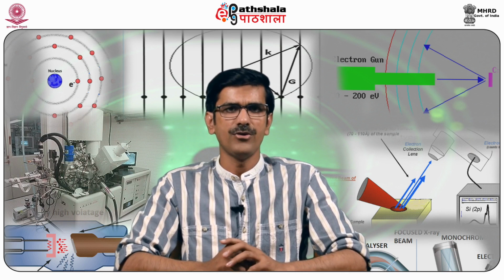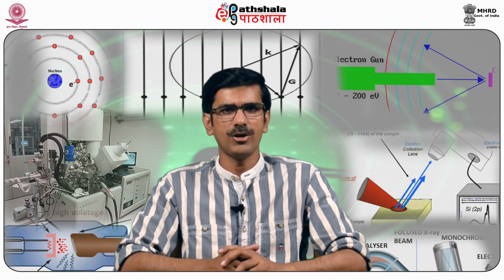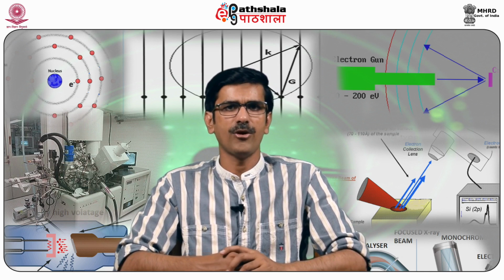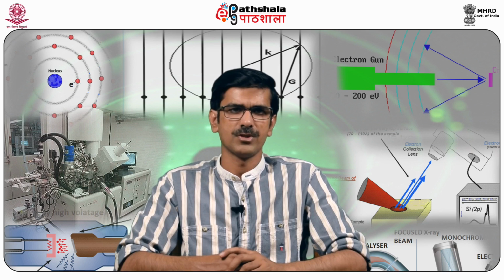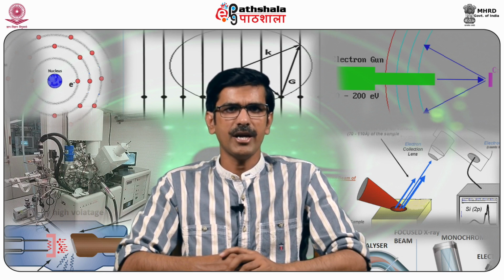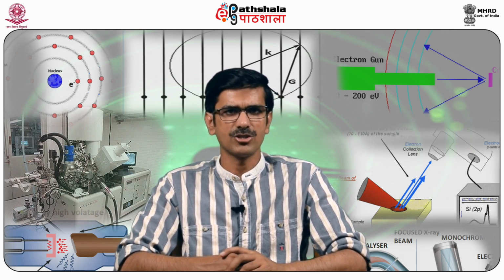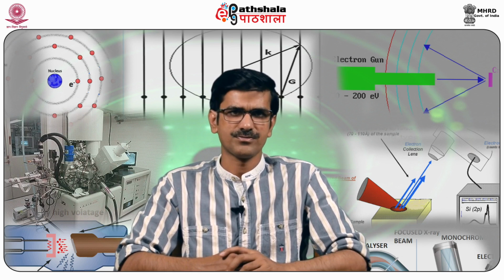Specific examples of UPS studies include: number 1, the measurement of molecular orbital energies that can be compared to theoretical values calculated from quantum chemistry. Number 2, determination and assignment of bonding, non-bonding and or anti-bonding molecular orbitals. Number 3, the binding and orientation of adsorbed species on the surface of solids. Fourth and the last is band structure mapping in k-space with angle resolved techniques.